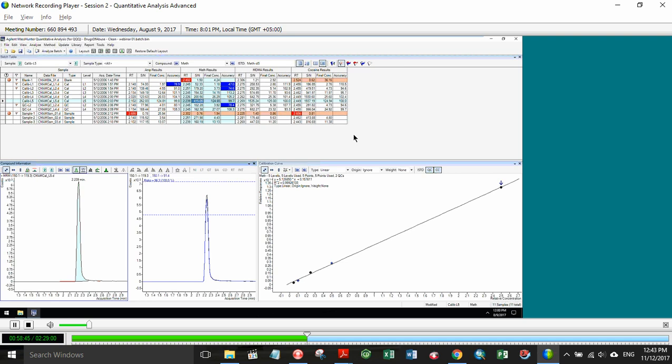Okay. The QCs, oh, by the way, Howard, did I cut you off? Did you have anything else to show before I jump into more questions? Nope.